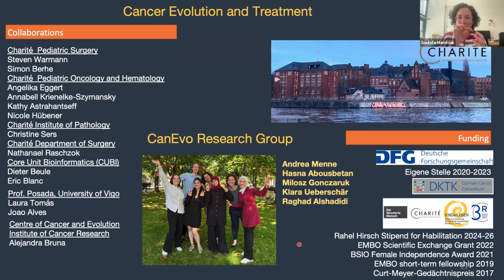You can see the cells on the outside grow next to each other in a very representative villi and crypt kind of pattern, and inside they're different. You get a necrotic core, which I find really interesting as well, because that happens in a tumor. The neuroblastoma are spheroids in a way. They are clumps of cells that like to stick together, and they usually grow floating. They don't settle. Oh, okay.